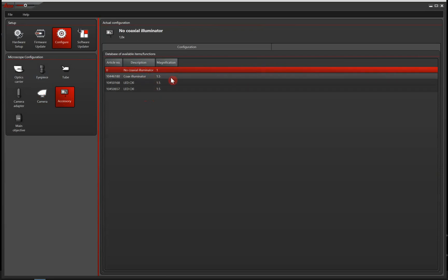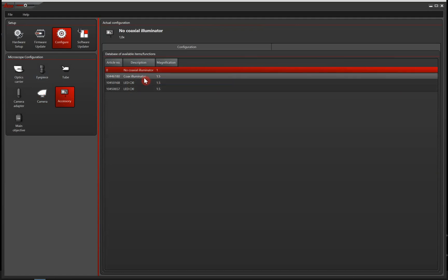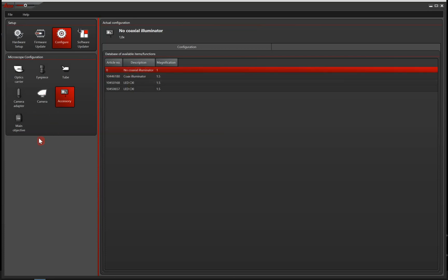And that coaxial illuminator has a magnification power of 1.5, and that is why you need to enter it here in the hardware configurator. But if you don't have that, then stay with no coaxial illuminator.